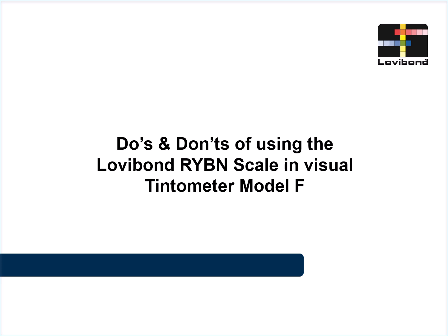Want accurate color measurement in oils and fats? Don't just rely on technology, master the technique. Welcome to this technical know-how session presented by Tintometer India. In this video, we'll take you through the essential do's and don'ts of using the Lovibond RYBN color scale on the visual Tintometer Model F, trusted worldwide for edible oil color measurement.